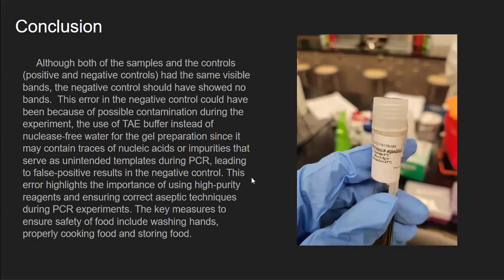This error highlights the importance of using high purity reagents and ensuring correct aseptic techniques during PCR experiments. Key measures to ensure safety of food include washing hands, properly cooking food, and storing food.